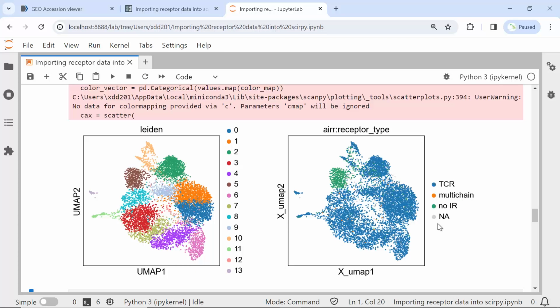So you can use this method to load your data and perform the T-cell clonotype analysis. That's for today's demonstration, to show you how to import data into Scirpy and create mdata for clonotype analysis.